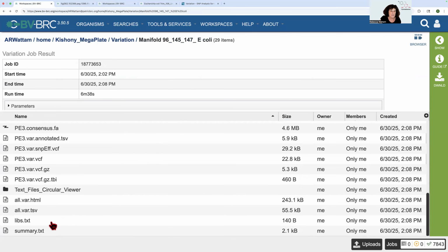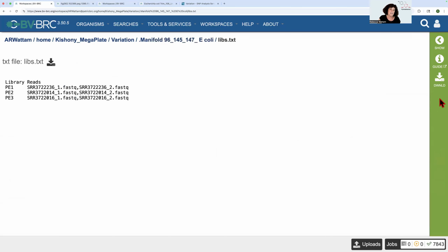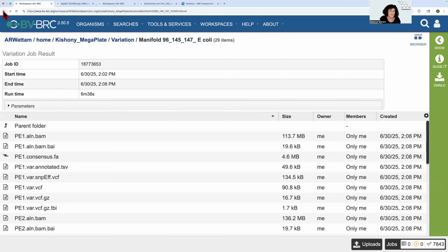All right, one more thing back on our results here, or actually it's 2 more things. Sorry, I have to scroll down. If you can't remember what each of those things you submitted are, the libs text will tell you. So you select that, click on the view icon, and it'll tell you who each of them were. And I know that this was number 96, number 145, and number 147. These are just a few of those over 200 samples that I chose to run this analysis on, although I've run them on all of them.